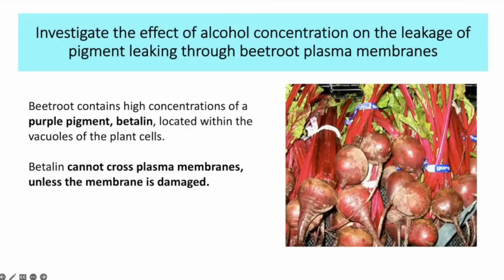So in this investigation, we're going to be looking at the effect of alcohol concentration on the leakage of pigment leaking through beetroot plasma membranes. So a little bit of background then.